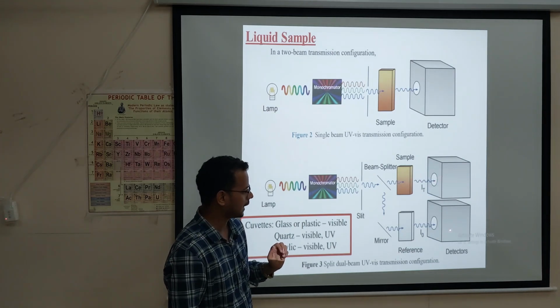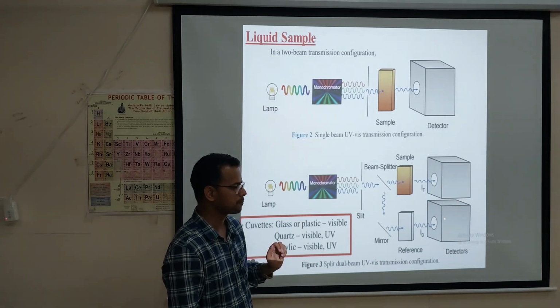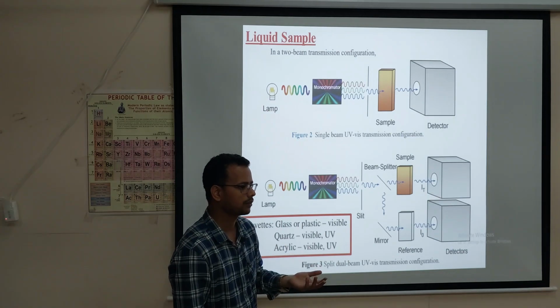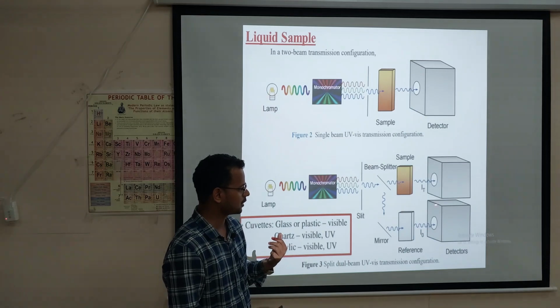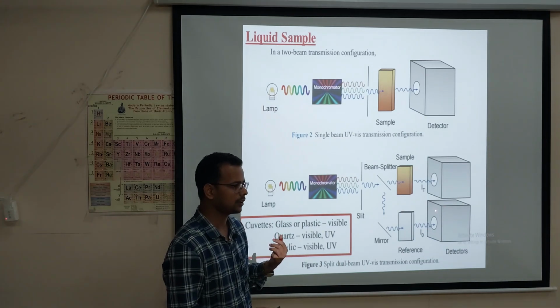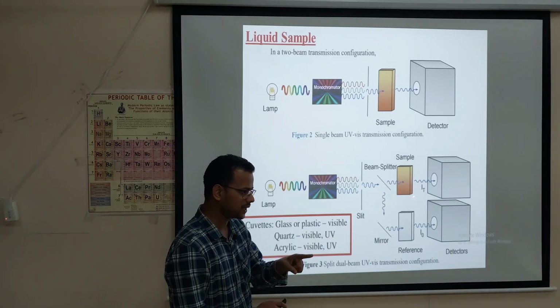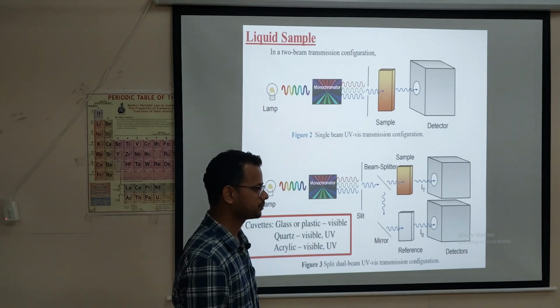So what will I do? Now I will compare what is the value of I0. Suppose total mark is 100, I have secured 95%, suppose 95, right. So how much energy got absorbed? 5, like that. So this is the transmission, and this is the 100% light. So from this variation we can calculate how much amount of solute is present in the solution. Then what is the concentration of the solution?